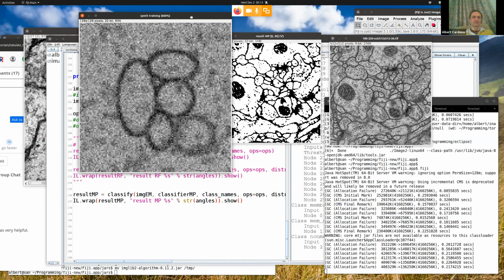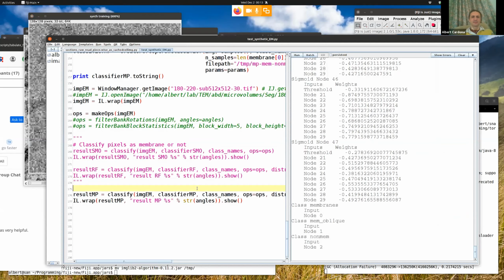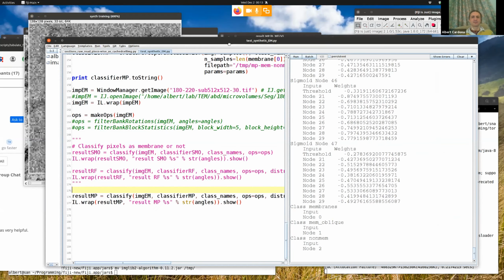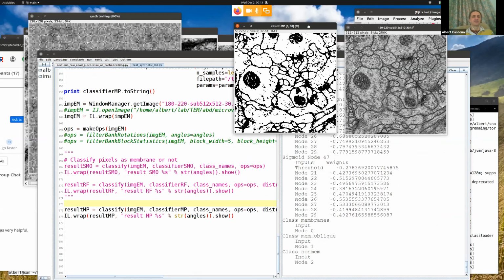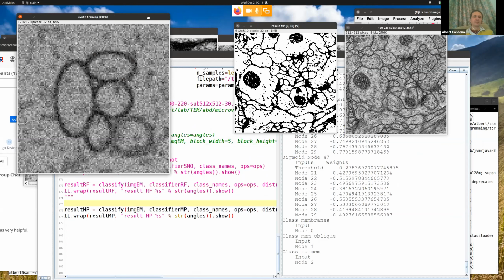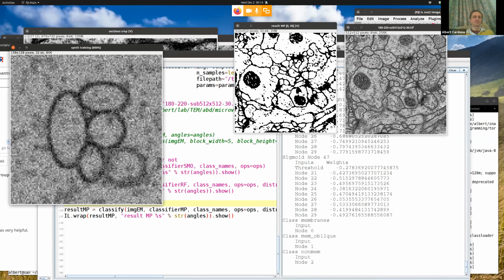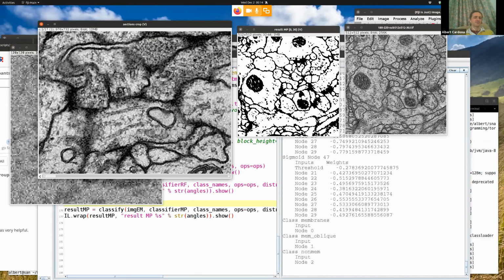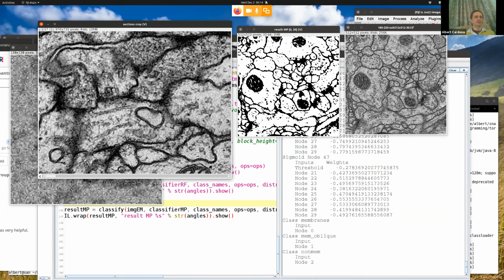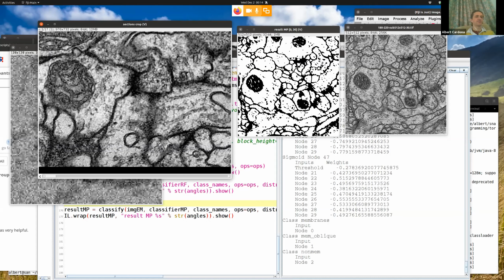And then with that, it classified a multi-layer perceptron that enabled it to do a classification that is actually not terrible, surprisingly, considering that this is garbage in, garbage out, right? So now, in the same way that we've run this, we can run this on our data, because what does it matter? This is just the image, right? So this is the image of our gigantic 10 terabyte data set that we're just browsing, piecewise by having it expressed as a cell image for ImageLib, right?